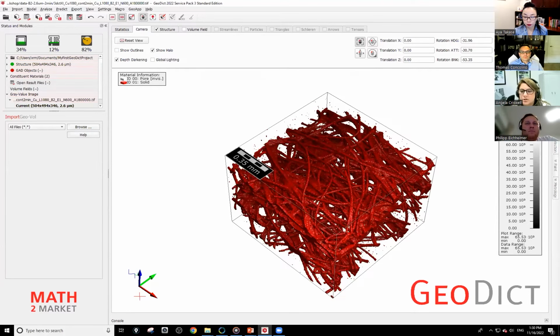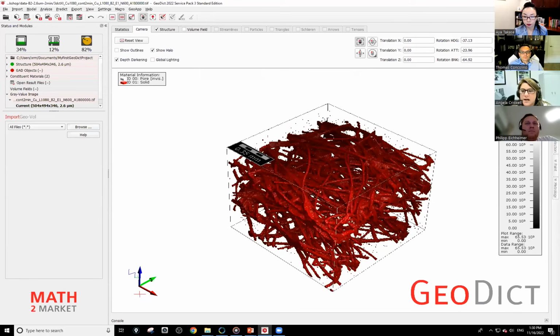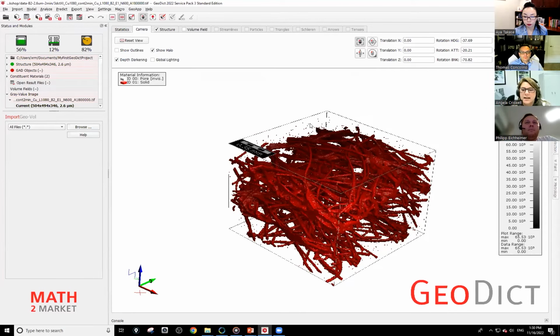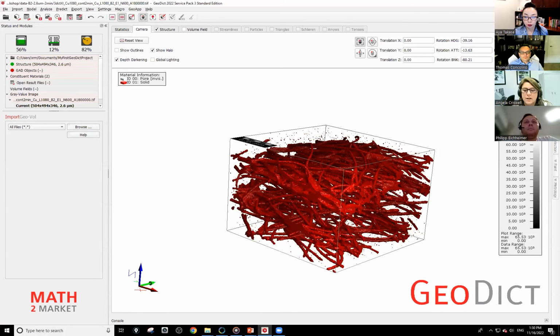So one of the things you should immediately notice here is we've got some noise. And in this case, there are pixels, or voxels rather, that are in the air that are mislabeled as fiber. And we certainly don't want to use this to calculate quantitative values or to go any further. So what exactly should we do? Well, we need to go back to image processing, and let's start using the image filters that we talked about.